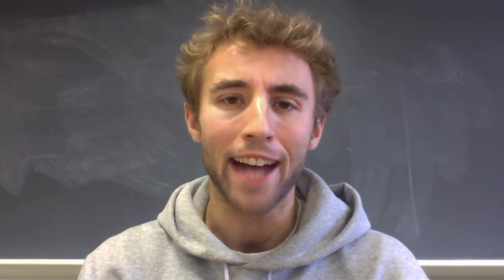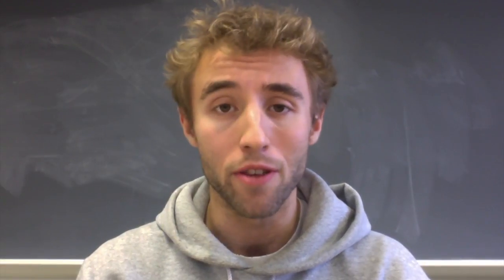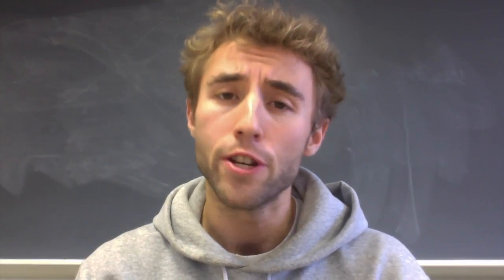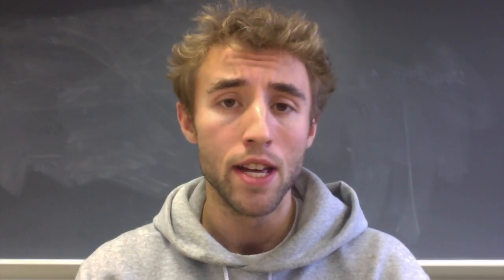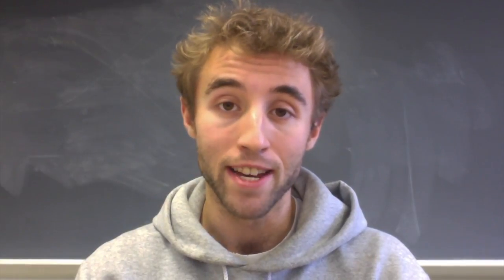In this Khan Academy video, we will discuss using equations based on data within Excel to determine certain important values. In this video, we will use data from the potentiometric titration lab, in which we used a redox reaction to form ferrocyanide from ferricyanide. Here we go.